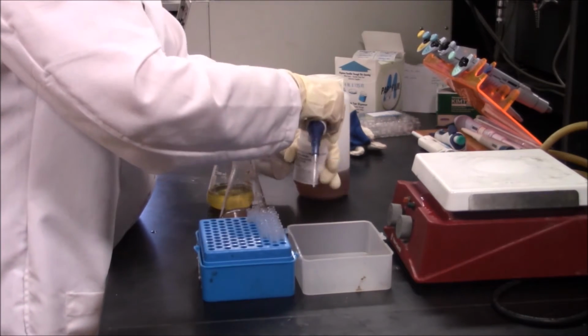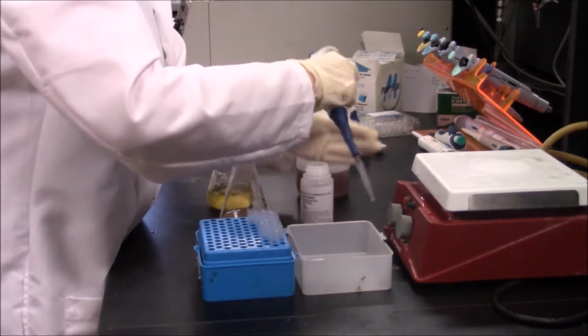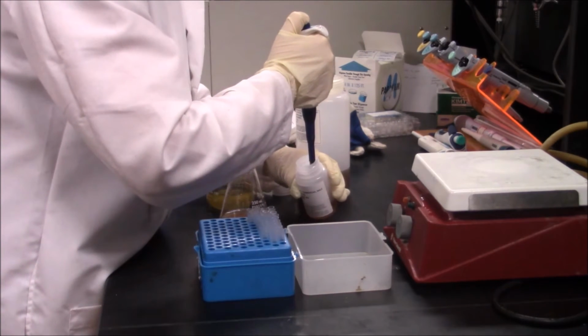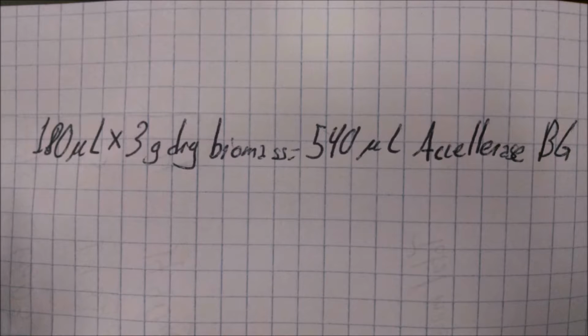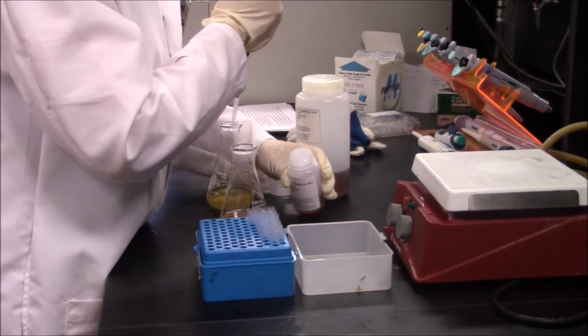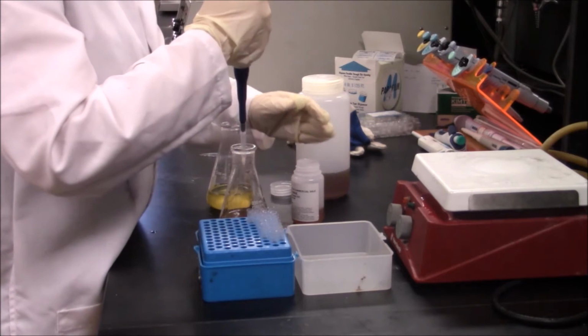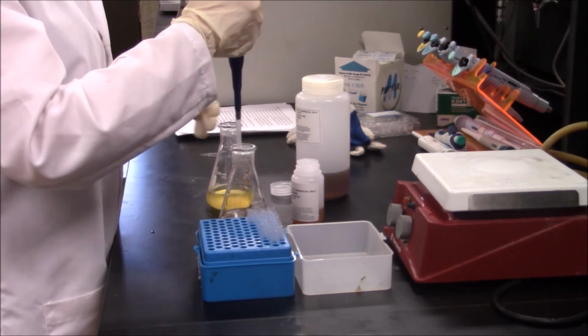Our other enzyme is called Accelerase BG. 180 microliters of this enzyme should be added for each gram of dry biomass. Since we have 3 grams of dry biomass, 540 microliters of Accelerase BG should be added using the 100 to 1,000 microliter pipette. Accelerase BG takes the reaction to completion by producing glucose from the cellulose breakdown products.